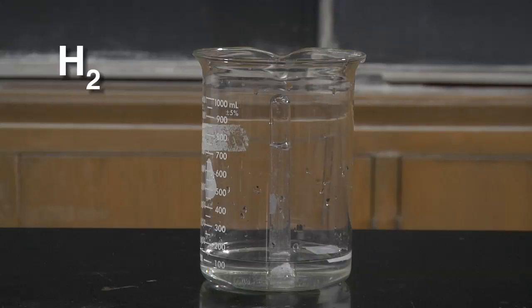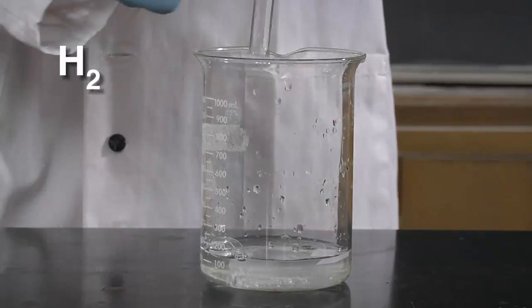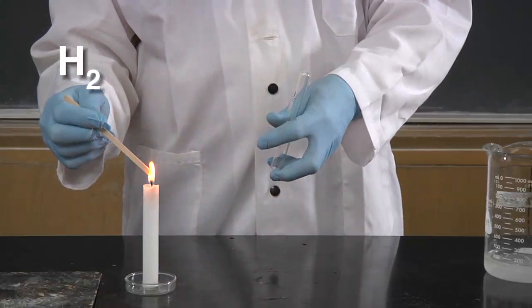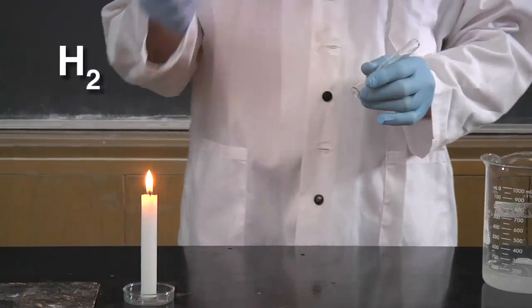When the test tube is about 1/3 full of gas product, remove it from the calcium. Remove the test tube from the beaker. The remaining water drops away, allowing air to enter the test tube. This is necessary for the gas test to work. Prepare the burning splint. Move this to the mouth of the test tube. The pop is distinctive to hydrogen gas.